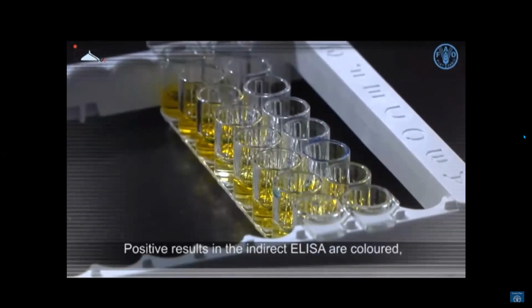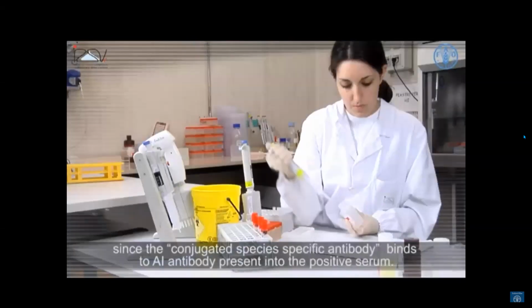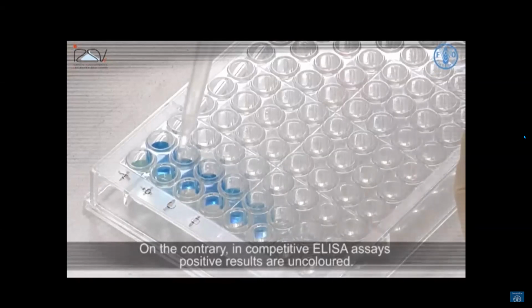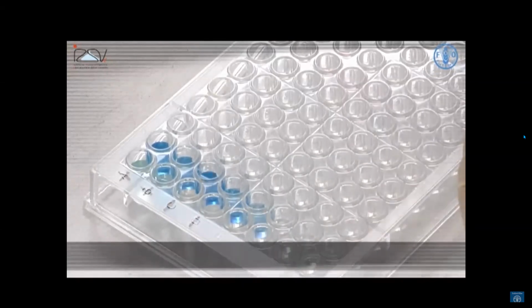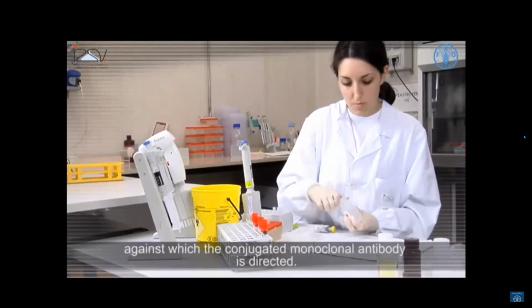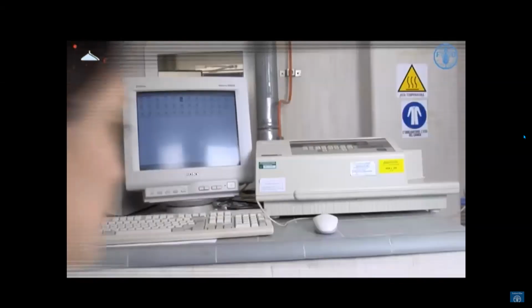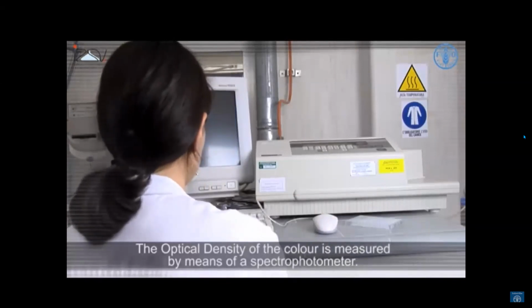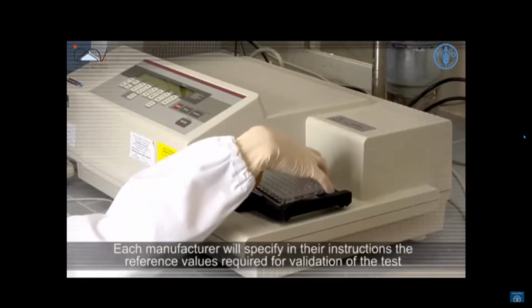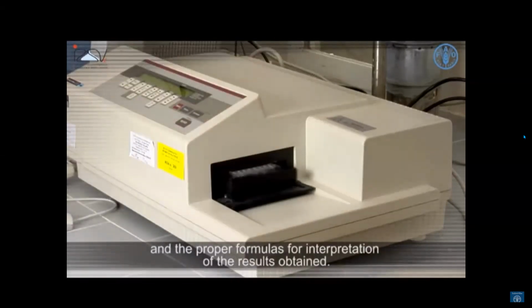Positive results in the indirect ELISA are colored, since the conjugated species-specific antibody binds to the antibody present in the positive serum. On the contrary, in competitive ELISA assays, positive results are uncolored. In positive sera, the antigen-antibody complex masks the epitope against which the conjugated monoclonal antibody is directed. The optical density of the color is measured by means of a spectrophotometer. Each manufacturer will specify in their instructions the reference values required for validation of the test and the proper formulas for interpretation of the results obtained.